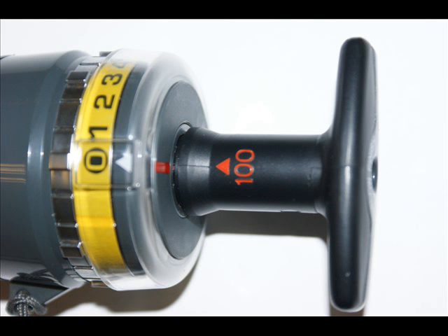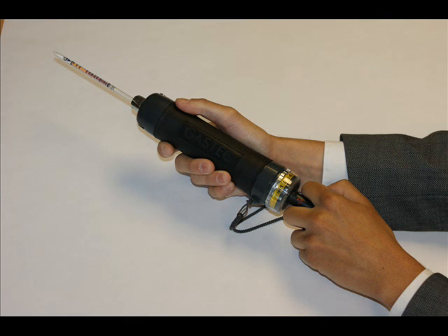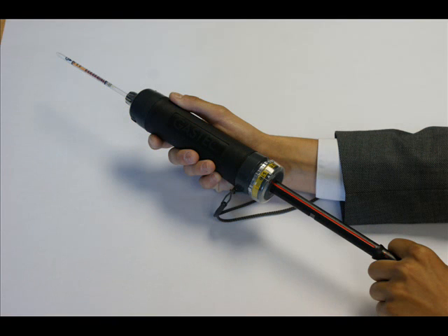For a full stroke, rotate the handle until the 100 marker lines up with the marker at the base of the pump. Then pull the handle until you hear an audible click. A vacuum has now been created within the pump, drawing the gas through the tube.